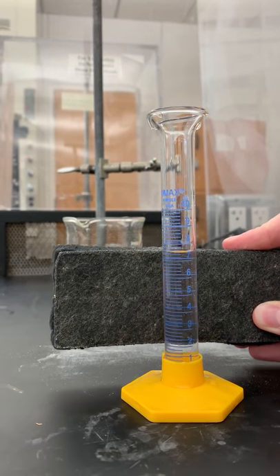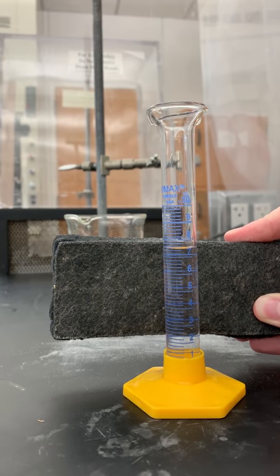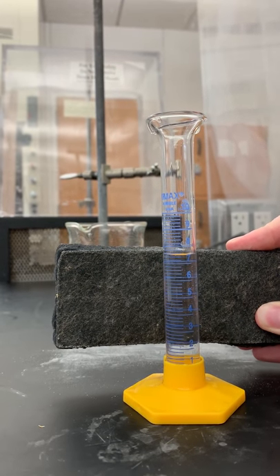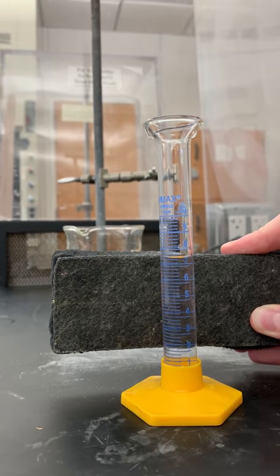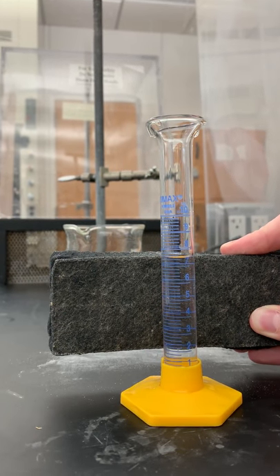If we hold it behind, just below the meniscus, we can see that it is 7.41. That is because of the number of lines and it is above the 7 whole number line. And that is how you measure using a graduated cylinder.